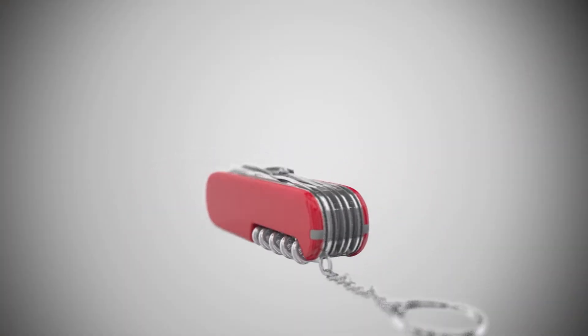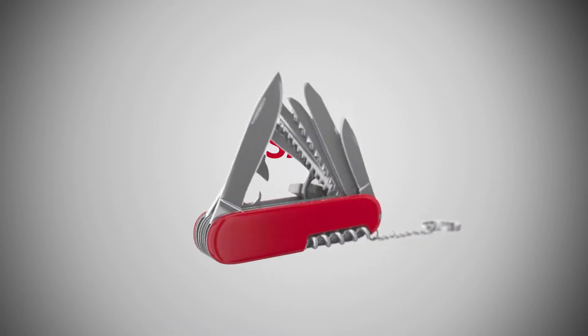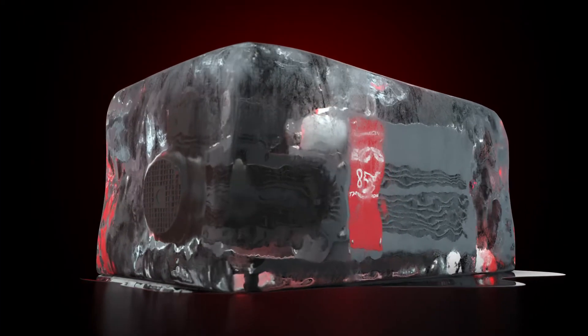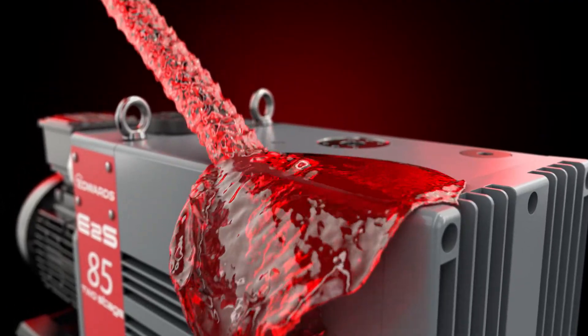This two-stage rotary vane vacuum pump is a versatile piece of equipment that can cater to the demands of many standard applications: freeze drying or vacuum ovens, degassing or gas production, coating or vacuum insulation, leak testing or research and development applications.